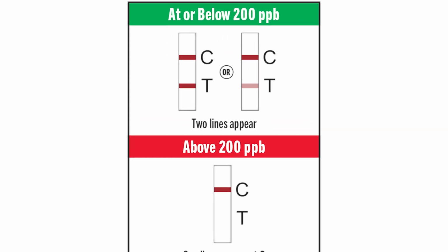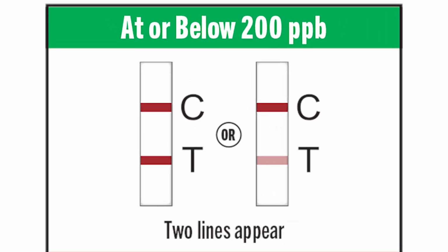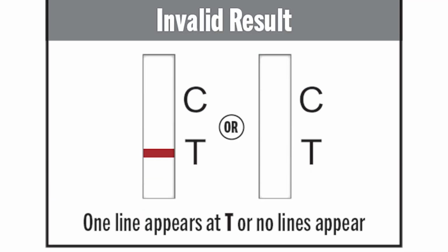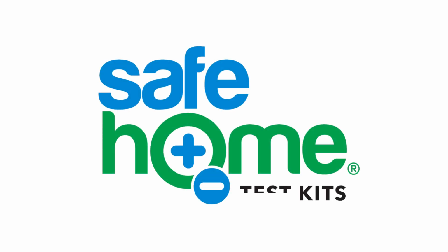Read your results by comparing the C and T marks on the cassette. If 2 lines appear, then the glyphosate concentration in your sample is at or below 200 ppb. If only 1 line appears at the C mark, but not at the T mark, then the glyphosate concentration is above 200 ppb. If no lines appear, or a line only appears at the T mark, then your results are invalid. If this is the case, please reach out to our customer service team and we'd be happy to assist you.